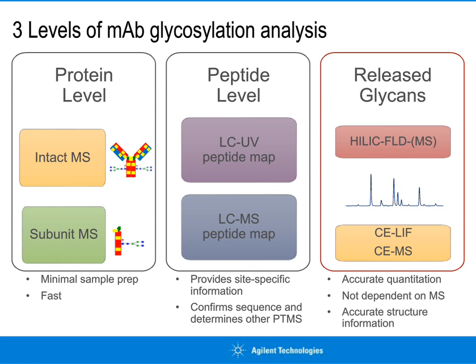Today, we will talk about analyzing released glycans by HILIC with fluorescence detection. However, it should be pointed out that there are other types of separation which can be used to study released glycans, including capillary electrophoresis and other types of chromatography.